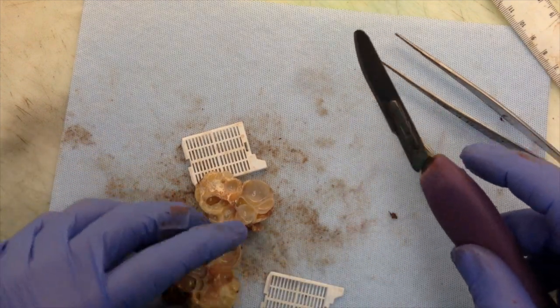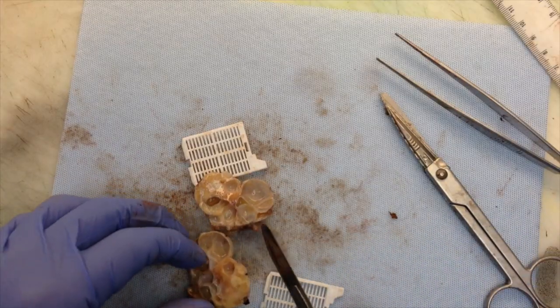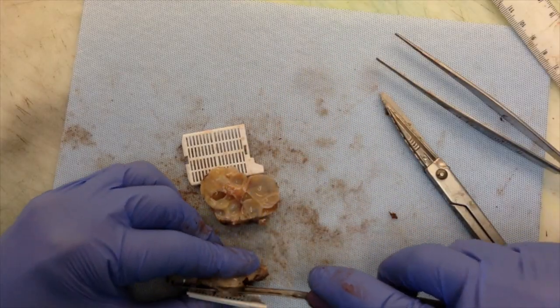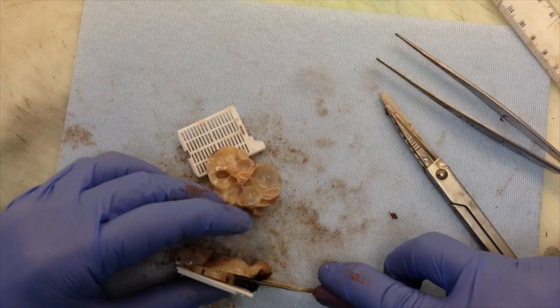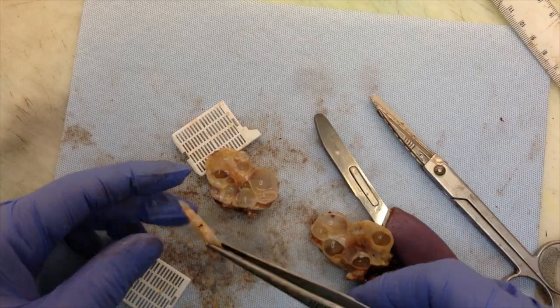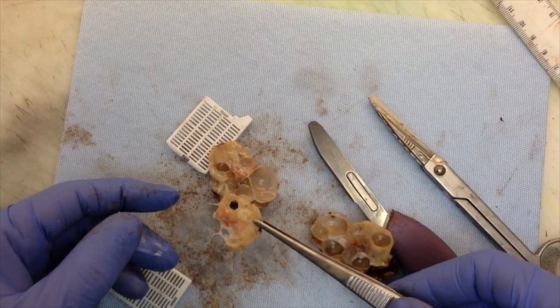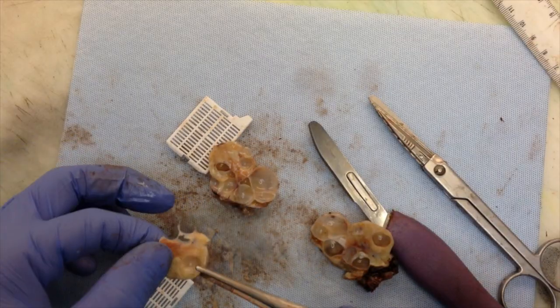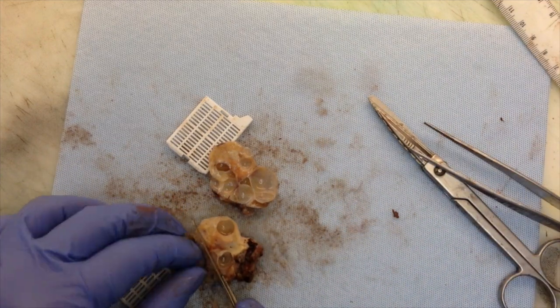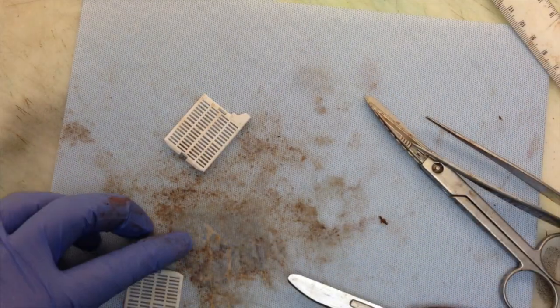So this is some residual ovary, and this is just cyst. So we're going to demonstrate cut section of this residual ovary, and I described that there's a possible corpora albicans right here. It's just white. So we'll just submit this piece. It'll show residual ovary and some cysts. And since this looks a little funny, we'll just submit 2 pieces instead of 1. Representative sections are submitted.